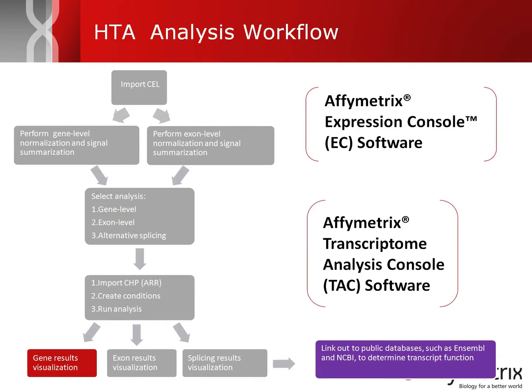The human transcriptome array, also called the HTA array, analysis is performed by two separate software packages at Affymetrix. The first, Expression Console, handles producing the gene level signals, or the signal estimates, and also functions as a quality control reporting tool so you can evaluate the performance of the arrays.